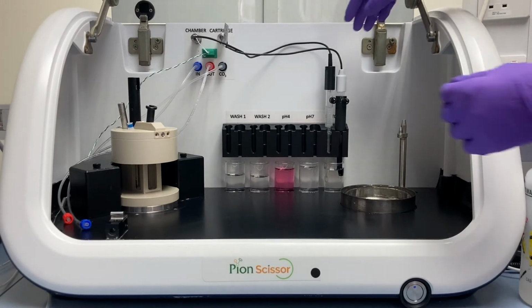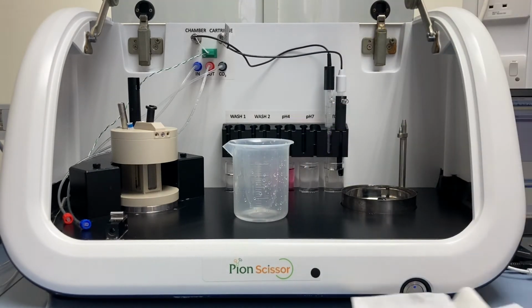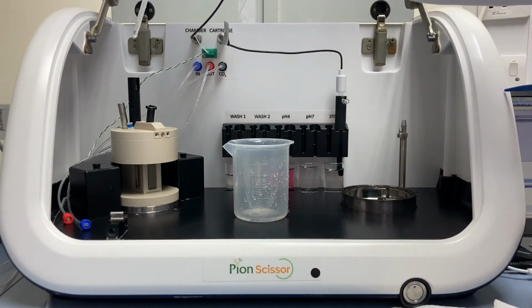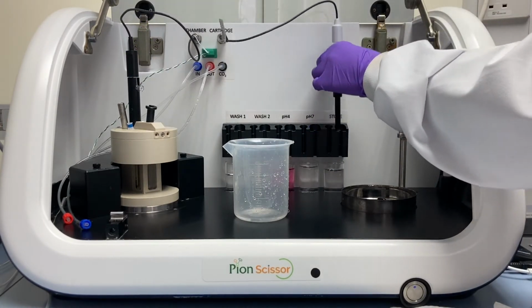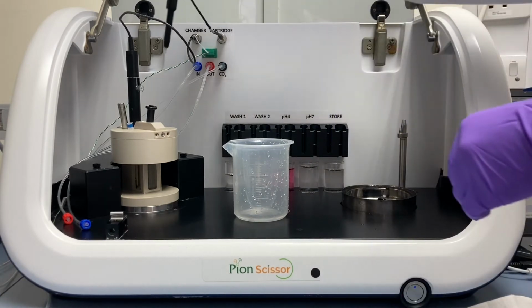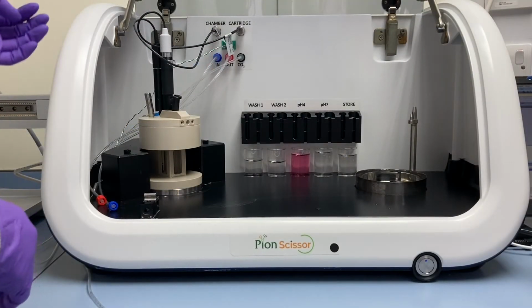We then add the pH electrodes which have been calibrated prior. The chamber electrode is placed at the back of the lid, and this reads the pH of the chamber buffer and works in conjunction with the external CO2 feed in order to mediate the pH inside the chamber at pH 7.4. The cartridge electrode is smaller and is placed directly inside the cartridge, and this monitors the pH change upon injection of the formulation.